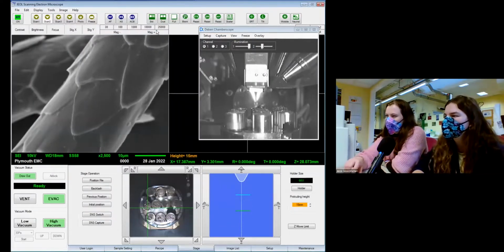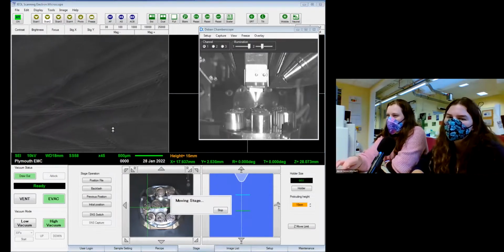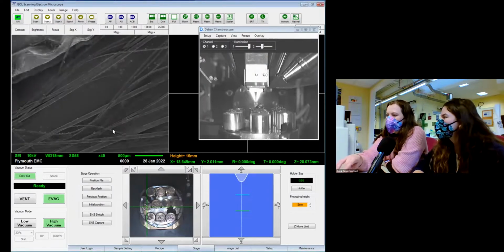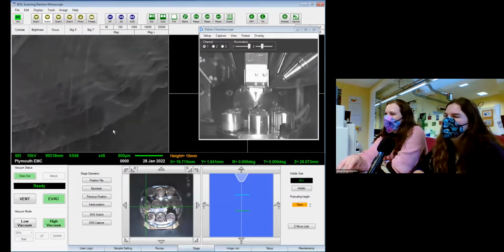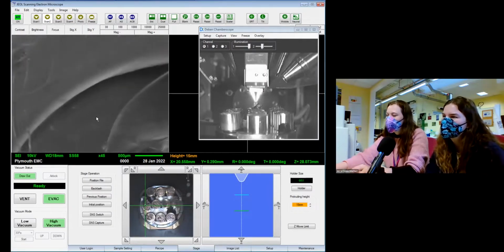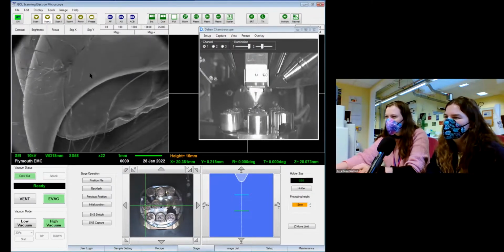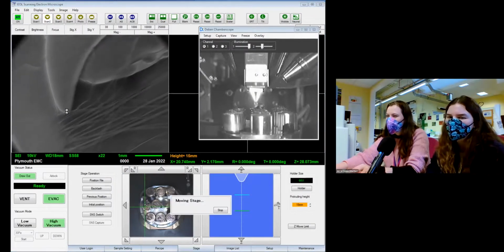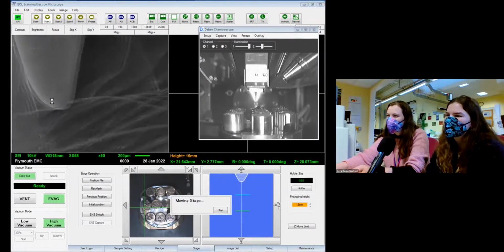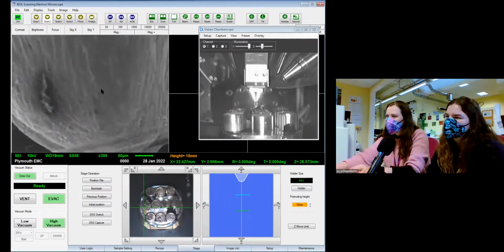There we go. Right, so we've also got a cat claw. My mum managed to find one of Wanda's claws in one of her blankets, and naturally I was like, I need to take that to put in the SEM. So we now have a claw. Should we find the point? It's the outer sheath of the claw, not an actual claw. It's the shed version. Not as pointy as I thought it would be. And of course I put hair on top of it.